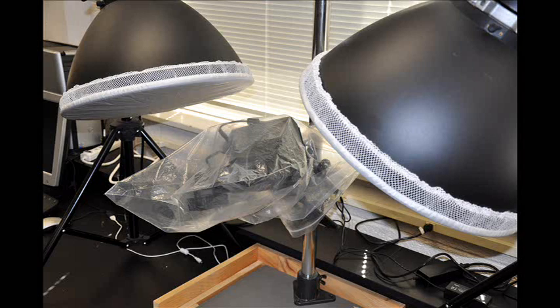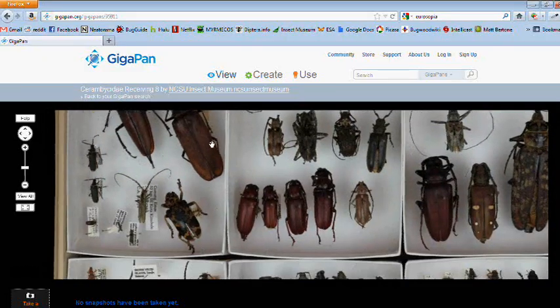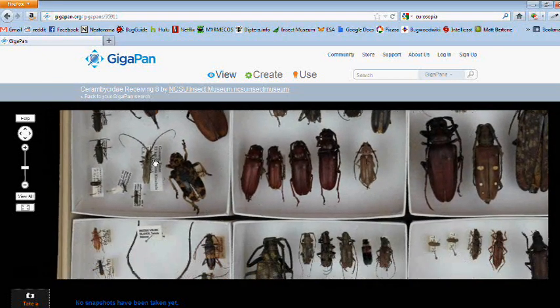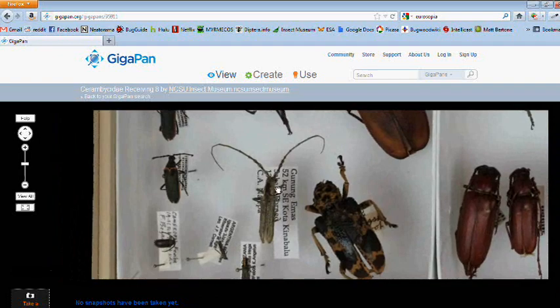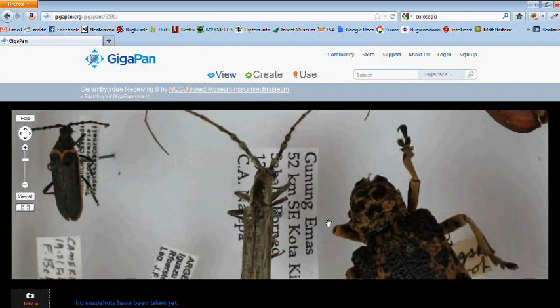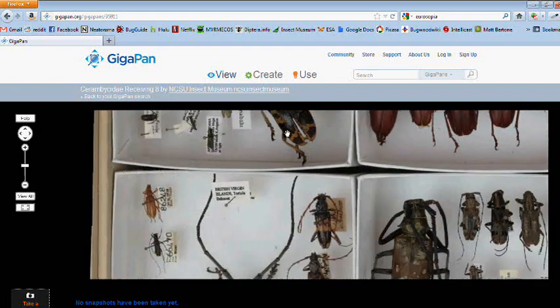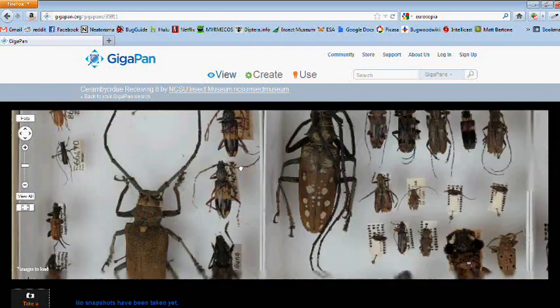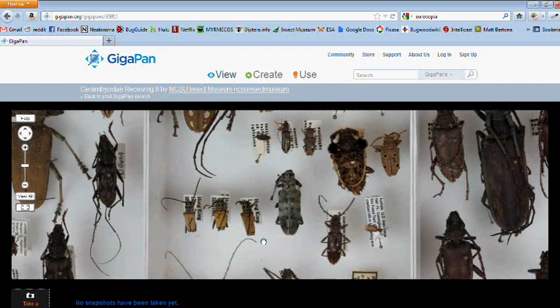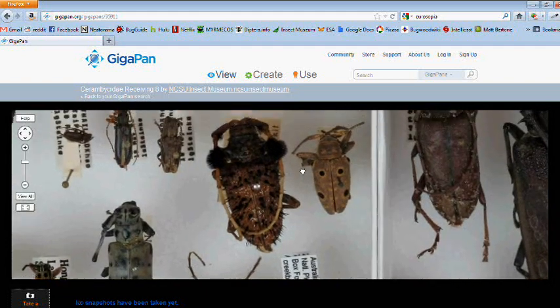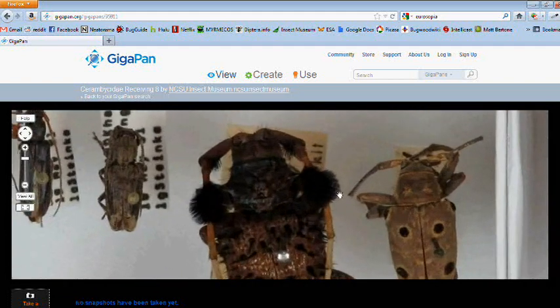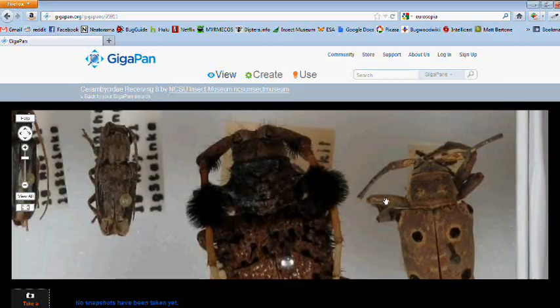Lastly, when not in use, we put a cover over the entire unit to keep it dust free. So there you have it. With these basic instructions, you should be able to capture multi-megapixel panoramas of most insect museum drawers. If you have questions or comments, please feel free to post them here or find us at insectmuseum.org. We have also provided useful links to information about the project in GigaPan. Good luck!